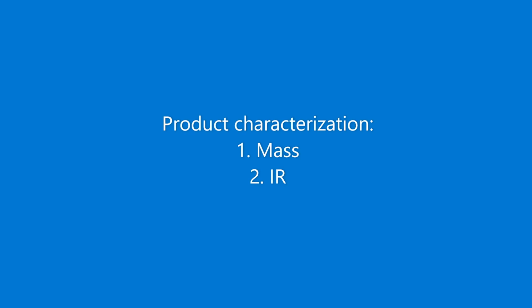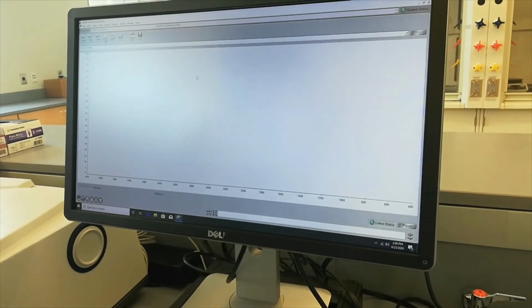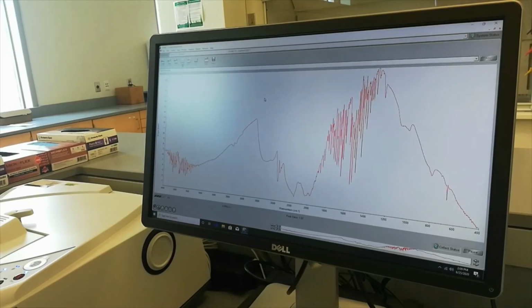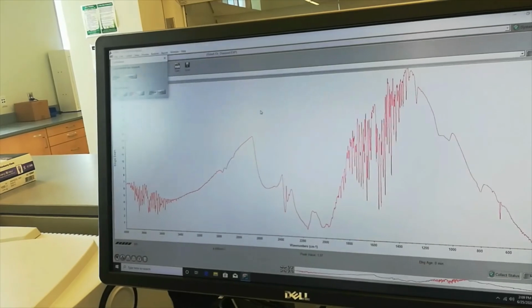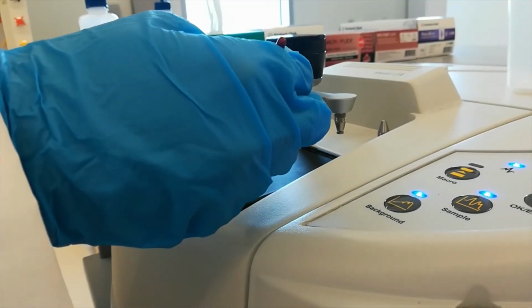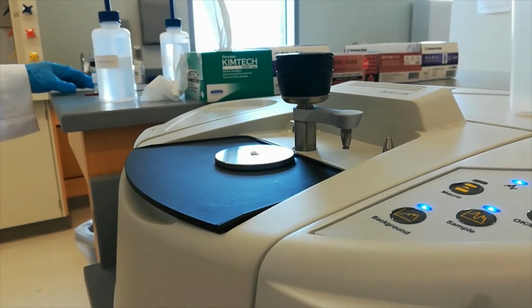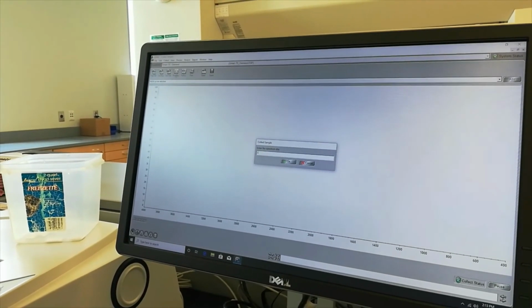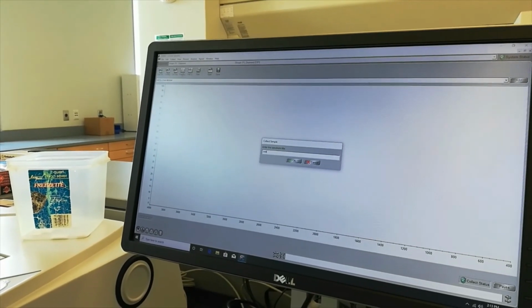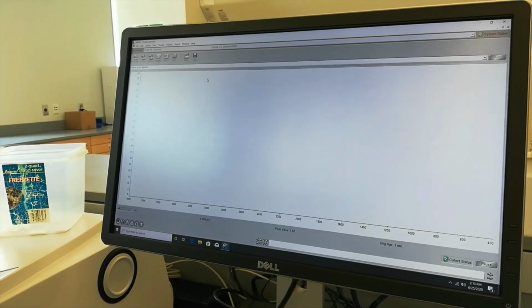For characterization of this product, we have taken the mass and we also need to take the IR, and there is no need to take the melting point. As we have seen in IR before, we clean the stage, we expand the window, and then we collect the background, and we wait for 8 rounds to complete. Then load our sample in such a way that the little hole is completely covered. Click on Collect Sample, name the sample, and then click OK, and then wait for 8 rounds to complete.